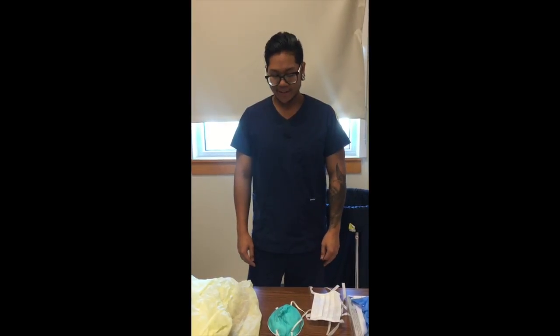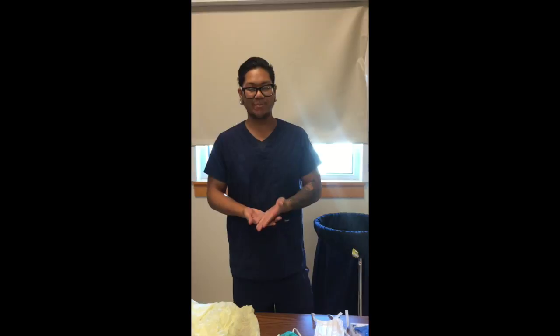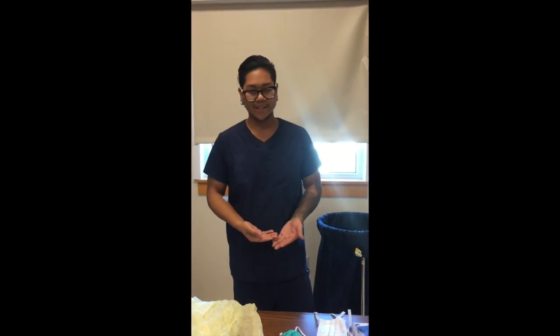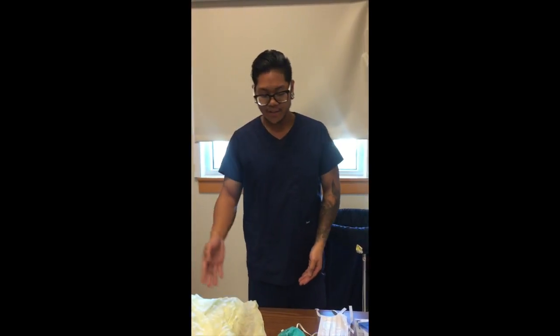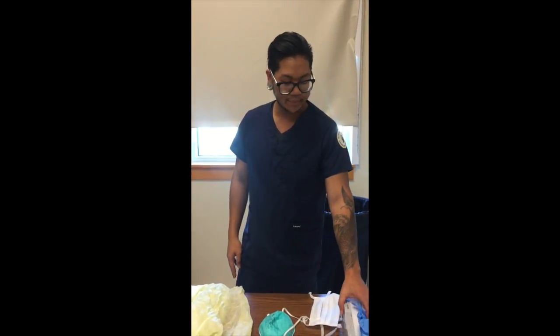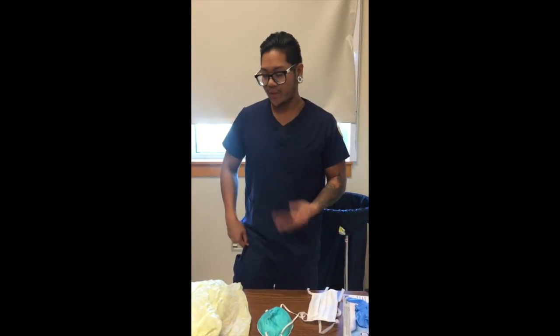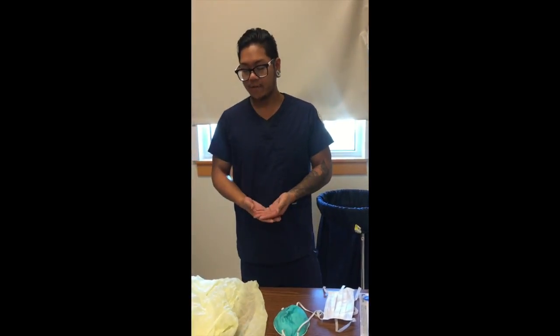Hi, my name is Scott, and I'm going to talk to you today about personal protective equipment, which is PPEs. So today we have gowns, N95 mask, a regular mask, and your latex gloves. The reason why we need these is basically for different precautions that are in the hospital.